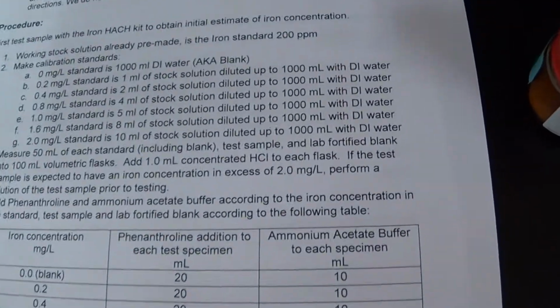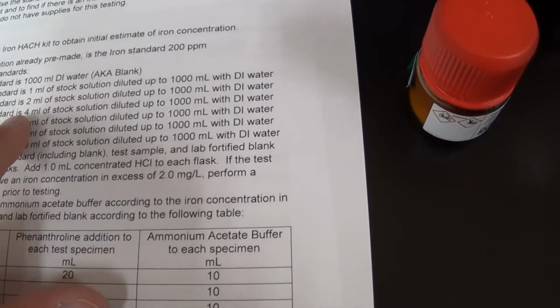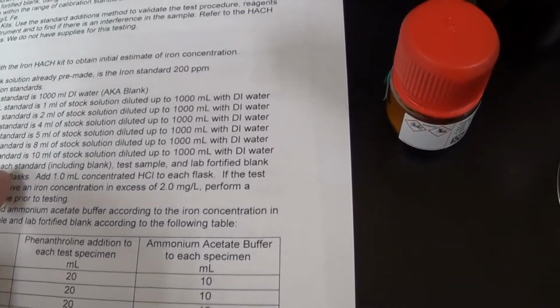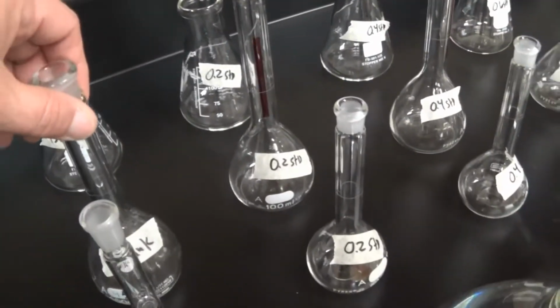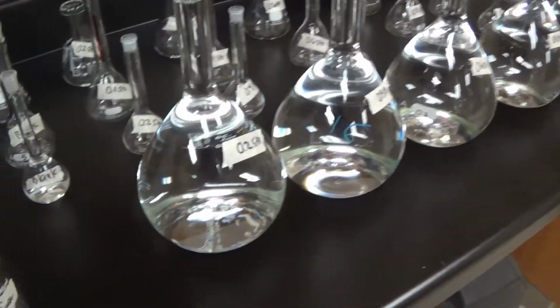So these are the directions to making the standards using our iron stock solution. I'm just going to add a certain amount of stock solution to one of these big flasks here. And then after that, we're going to pour a little bit off, add HCl and the color reagent and the buffer, and fill that up. Then we're going to mix it, and then run it on the spectrophotometer.